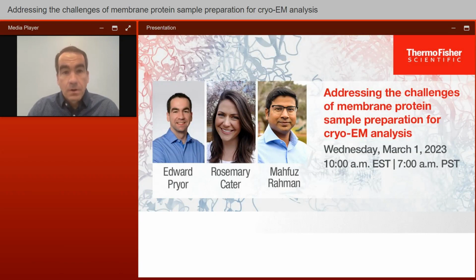She'll describe how she and her lab used this approach to determine the cryo-EM structure of the major facilitator superfamily domain containing 2A, which has a molecular weight of 58 kilodaltons, to a resolution of 3.0 angstroms.